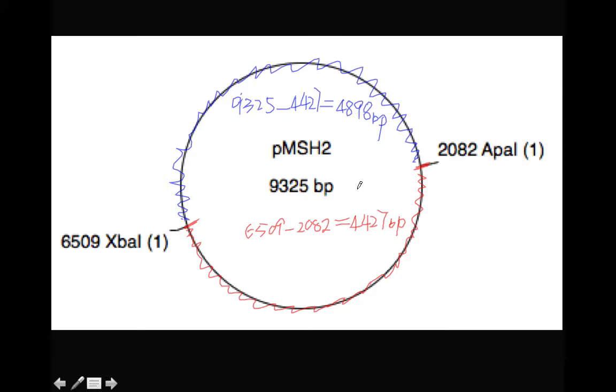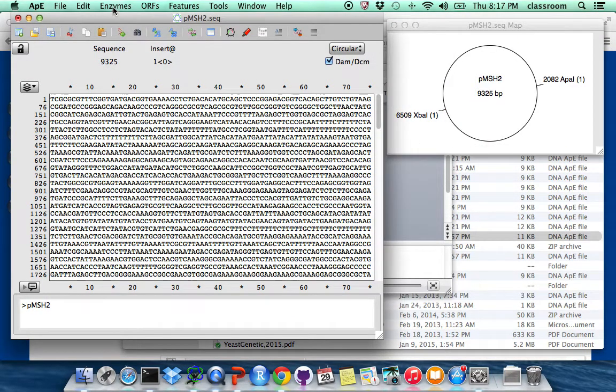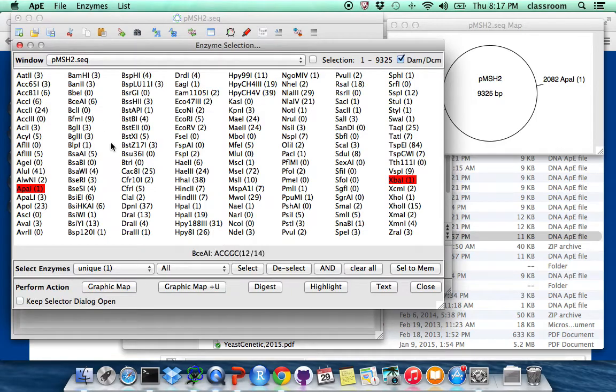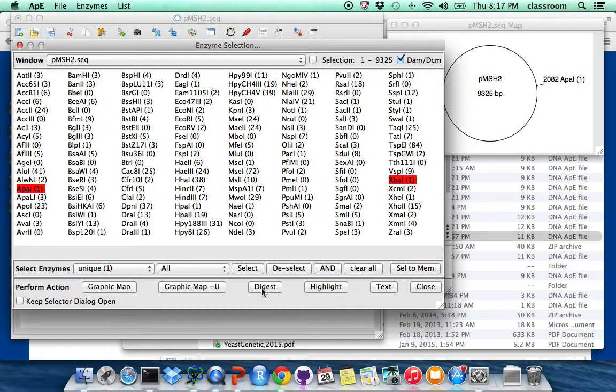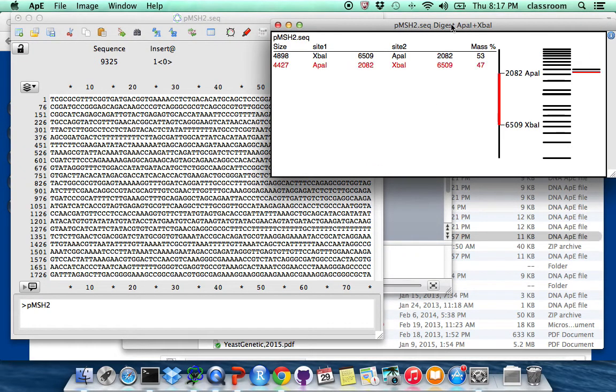Unfortunately, on the APE, it can do this automatically. So we go to Enzyme, Enzyme Selector, and you see at the bottom, there is a button called Digest. We click on the Digest.